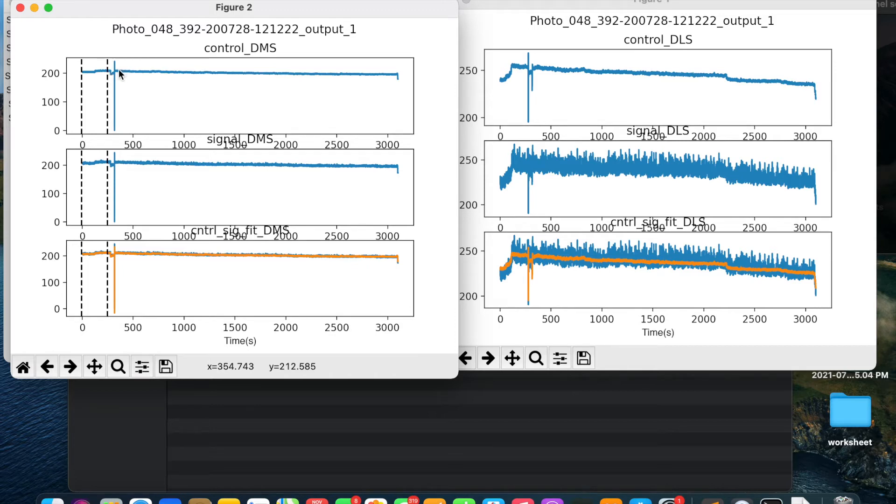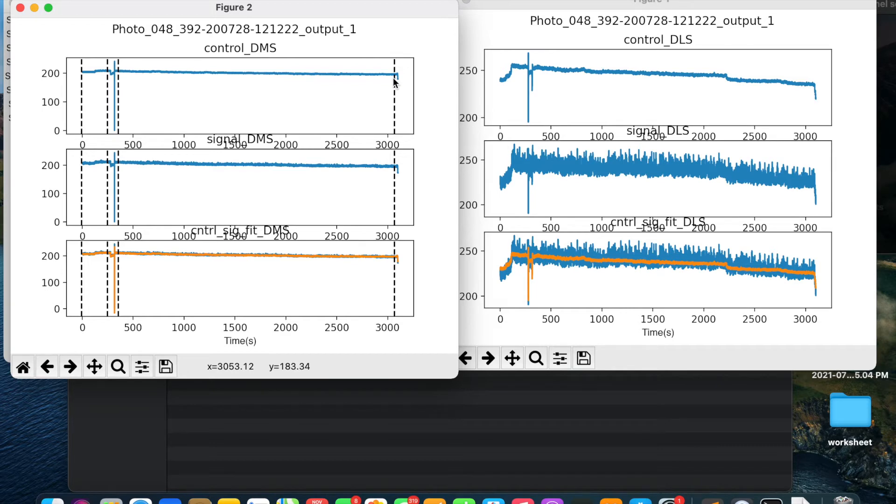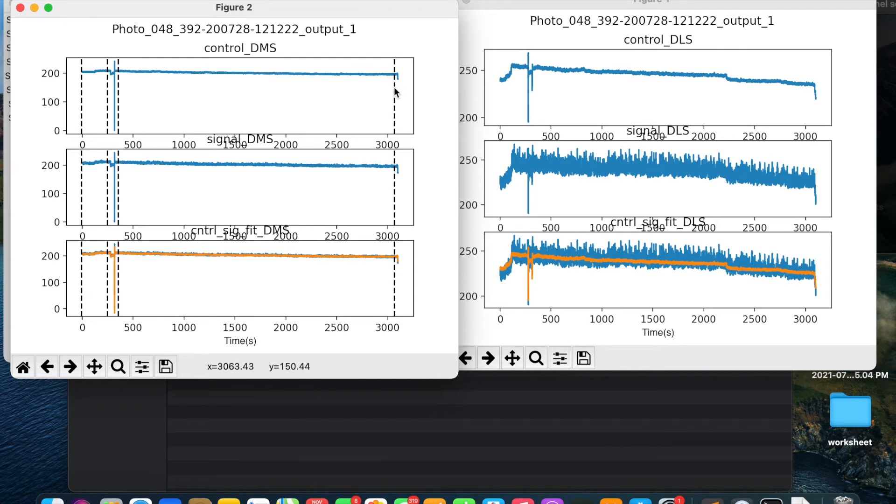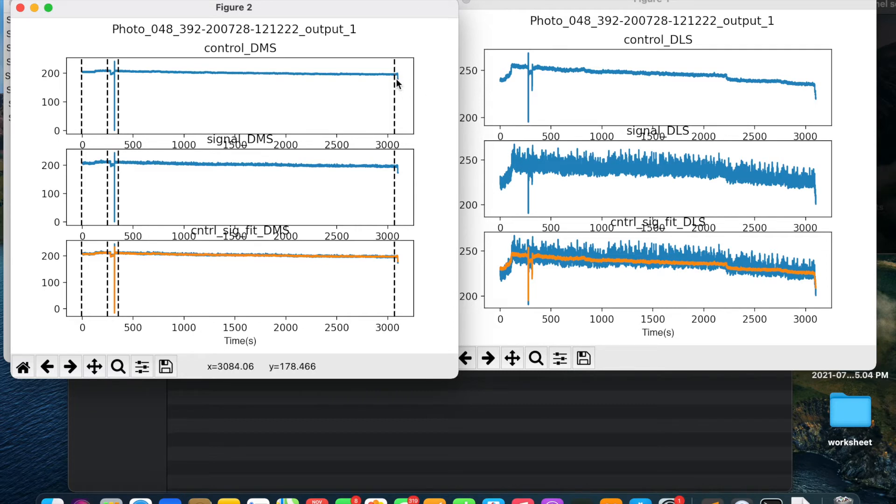We will do the same for another chunk. Select the start point, select the end point. Suppose by mistake you have selected the wrong point, then you can delete that point by hitting D key on the keyboard, D as in dog. So suppose this last coordinate was not selected properly, then I will hit D key and it will get deselected. I will again move the cursor to the correct point and select it using the spacebar key.